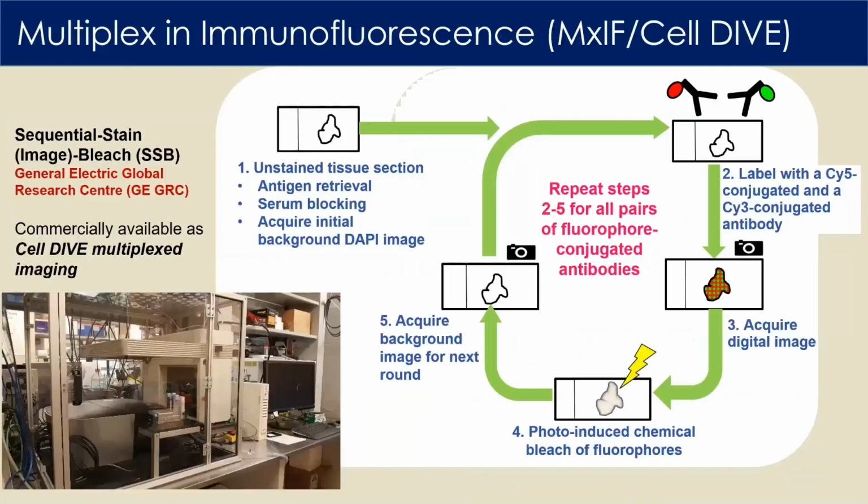The protein multiplexer that we have in the lab is called MXIF, or multiplex immunofluorescence, which is now commercially available as the Cell DIVE imaging system. It is based on a sequential stain-bleach method, whereby each round of staining will consist of a pair of Cy3 or Cy5 conjugated antibodies.